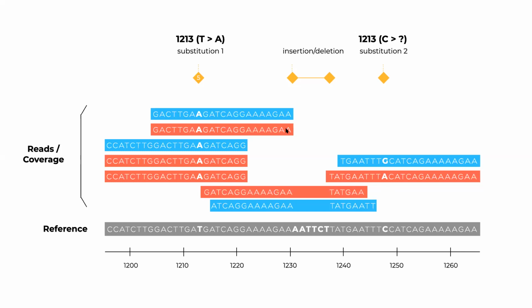And the reason for having more coverage, which is what this is called, is because of these kinds of situations, especially if we have a lot of mutations occurring all the time, and those mutations are of different kinds. So here you have two examples of substitution. Here's an insertion or a deletion. How do we know this is a deletion? Here we have blanks as opposed to this sequence in this region of the reference genome. So to avoid these kinds of ambiguous changes, we need high coverage, right? And high coverage is just the number of reads in that specific position.